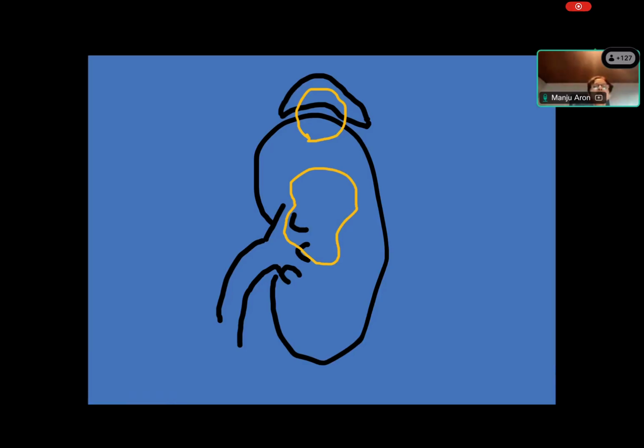Here's another example. When you have a tumor in the superior pole of the kidney, it may directly extend into the adrenal gland, which is shown up there, and that may then be indicative of extension directly into the adrenal gland. And then essentially, I'm just trying to show you how we have to see if the tumor is encroaching upon the pelvicalyceal system or infiltrating it. So you have to take sections from all this to document extension.